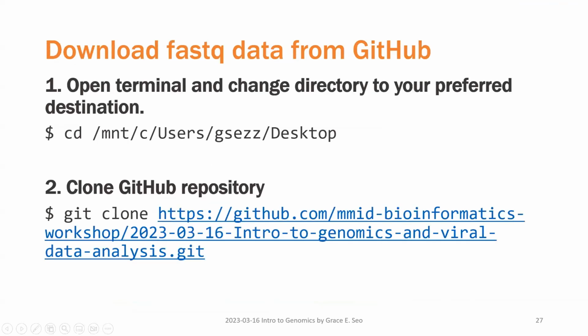Okay, so now we'll go back to doing our hands-on. So I will show you this through my terminal, but these slides are available on the GitHub if you'd like to follow along with the slide on your computer.